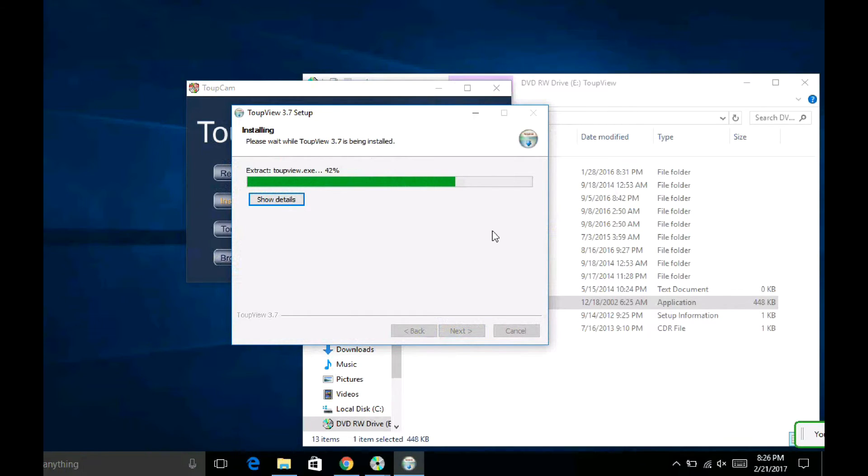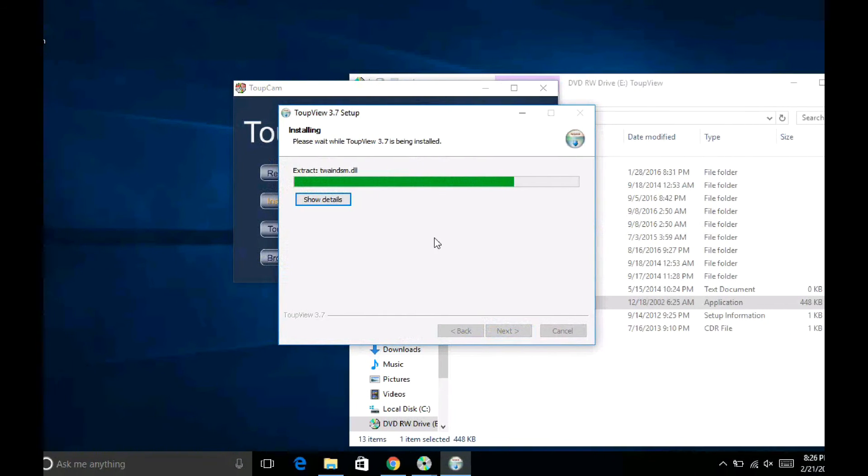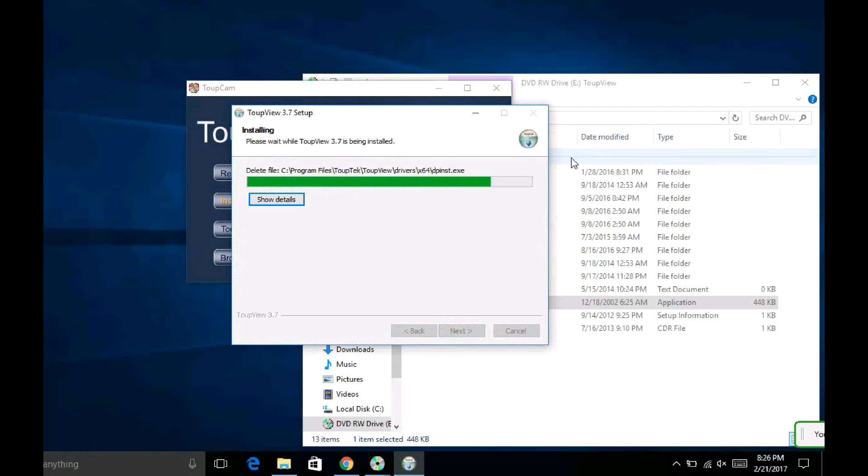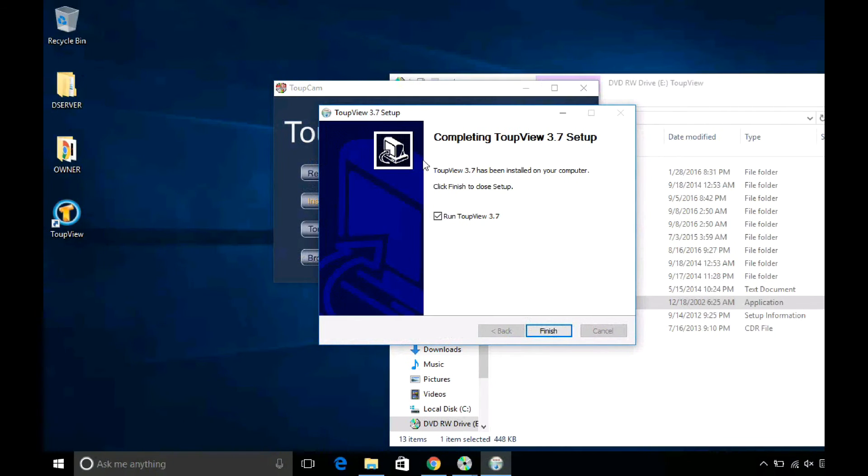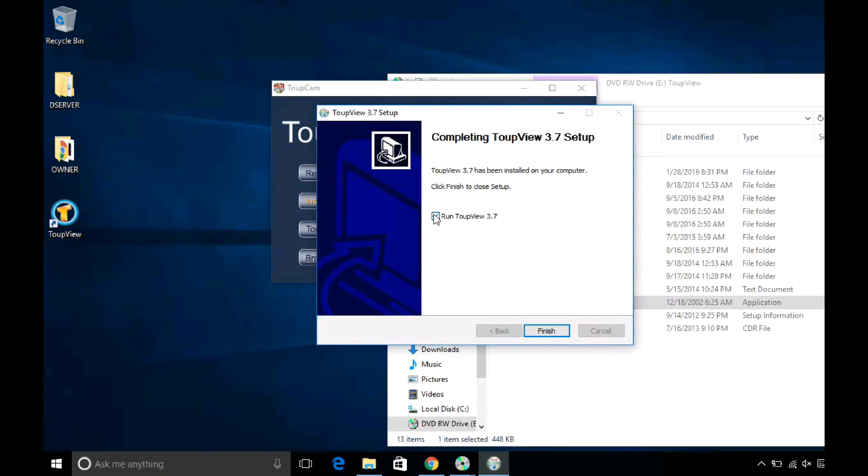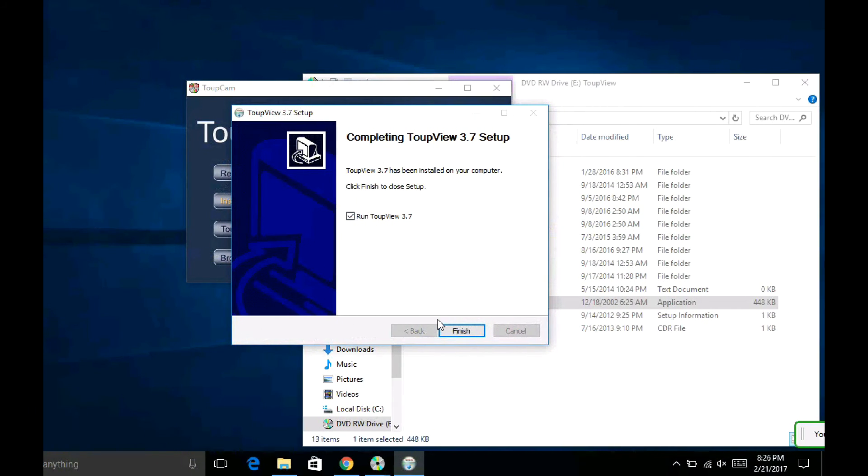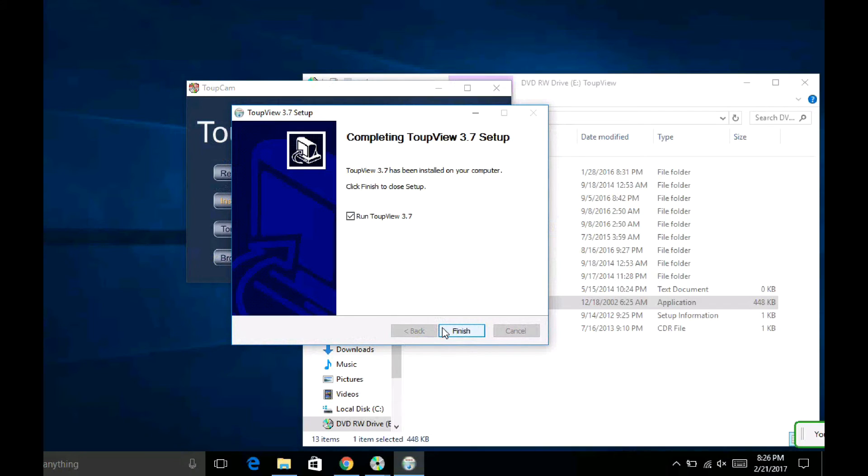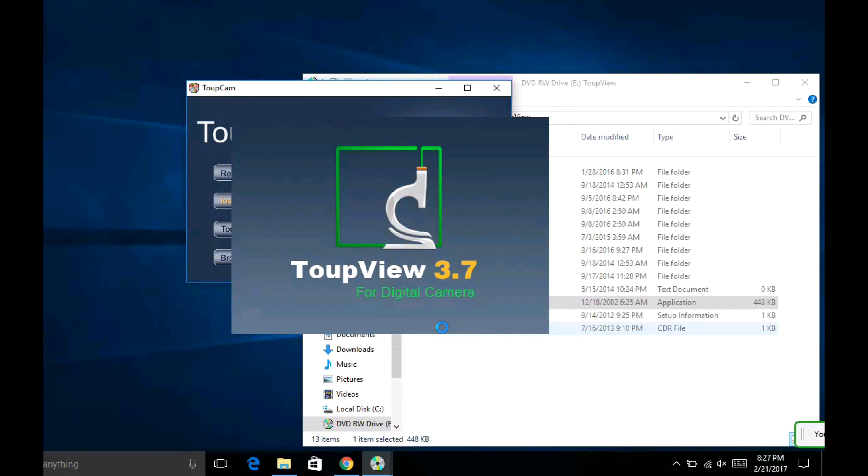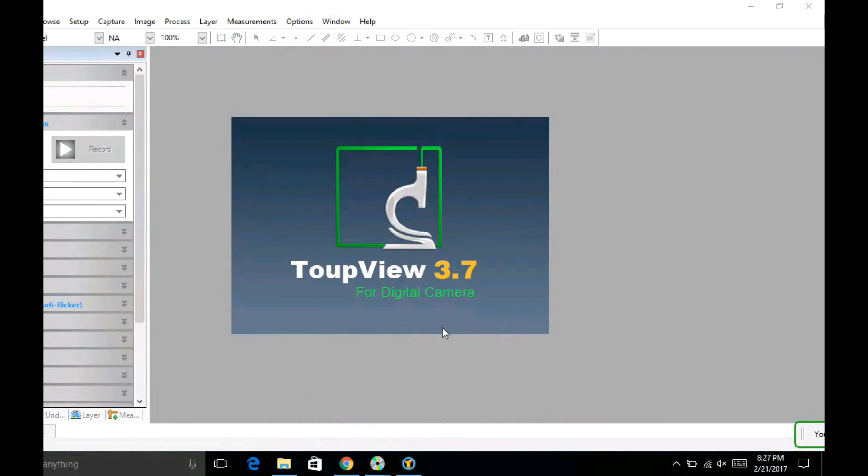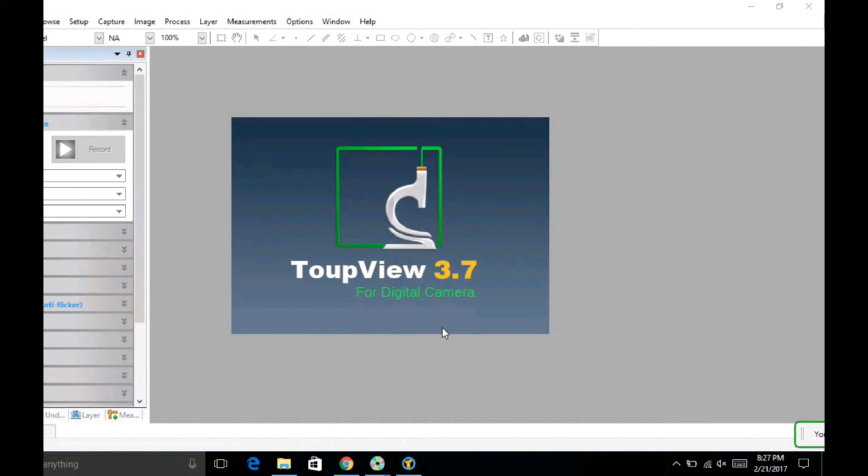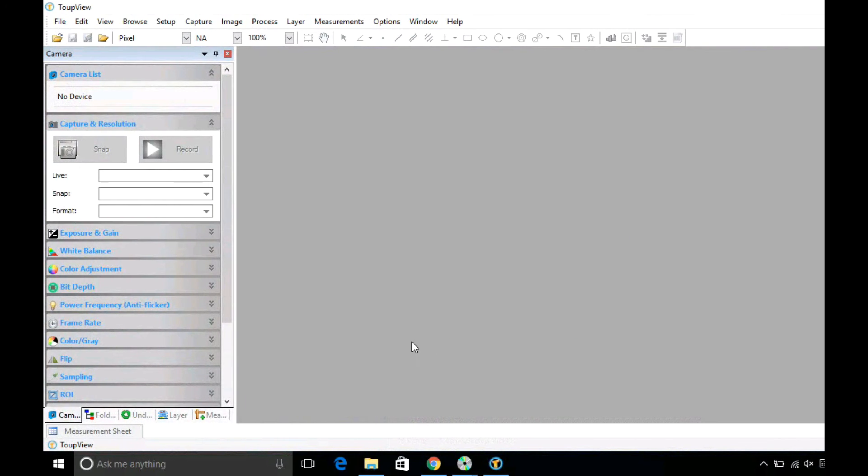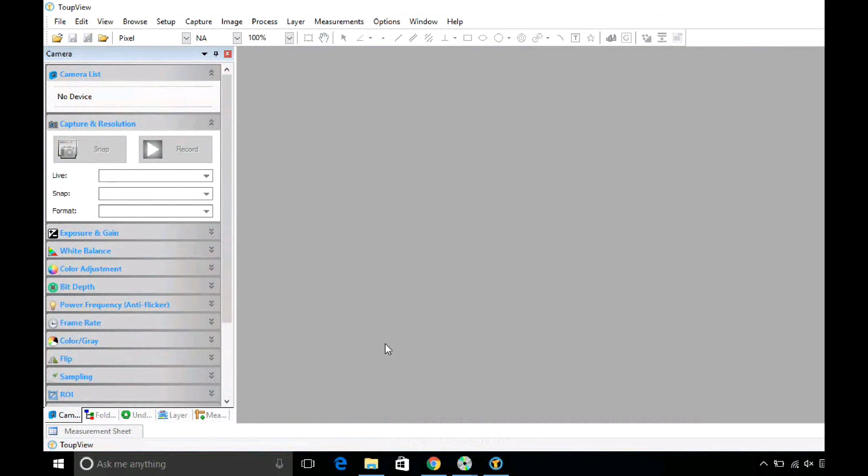It didn't take too long, so now we'll launch the software called TopView 3.7. Here we go. At this point I don't have the camera installed just yet, but this is just the installation video.